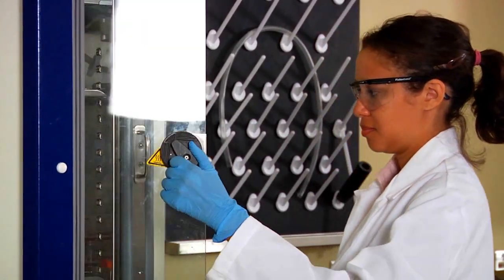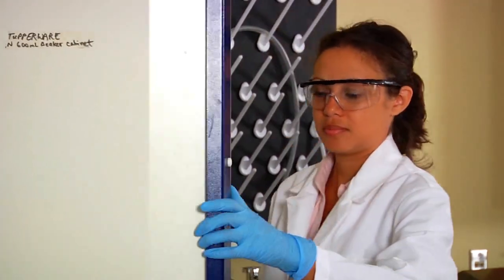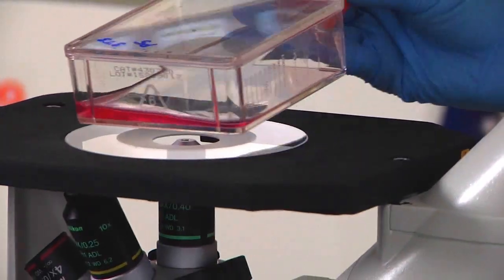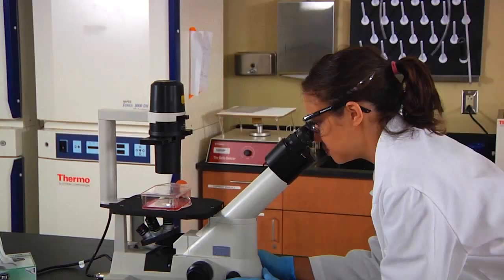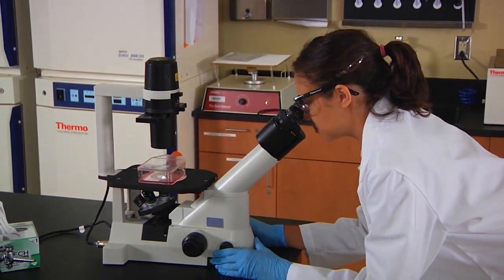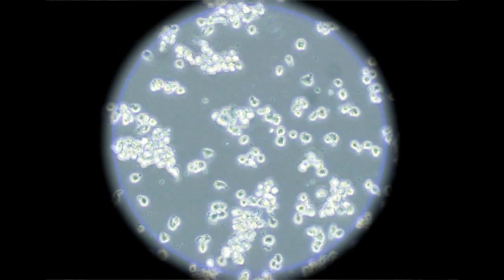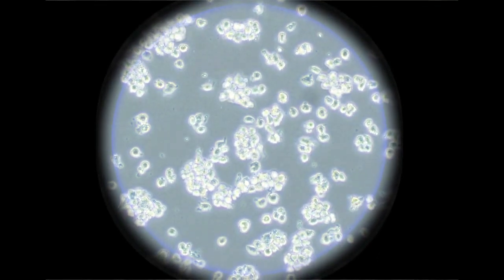Remove the flask from the incubator and use an inverted microscope to check for dispersion. The cells in our culture are properly dispersed. As you can see, the cells are detached and floating.